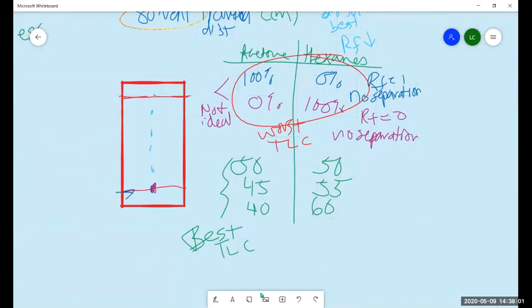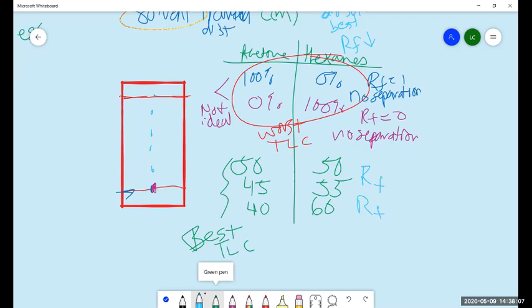And again, you will have noticed there's like 4 RF values you calculate. And then you probably notice that this is xanthophylls, this is chlorophyll B, chlorophyll A, and this is your beta carotene based on polarity.